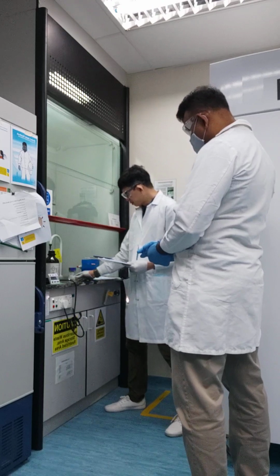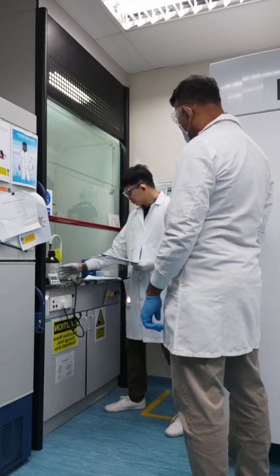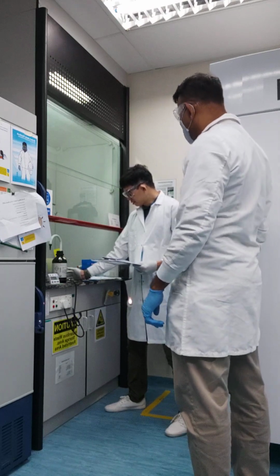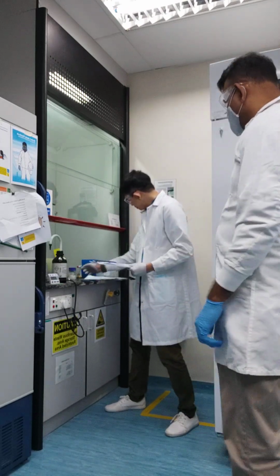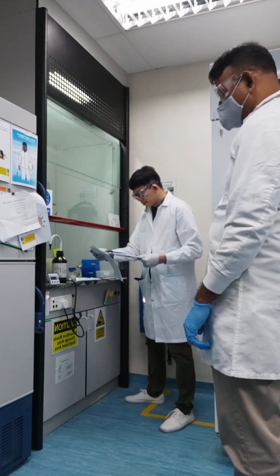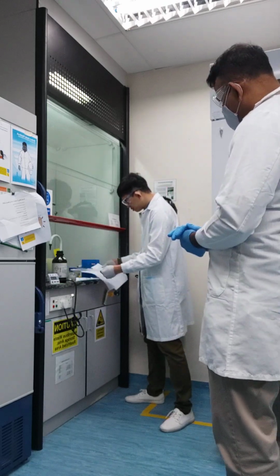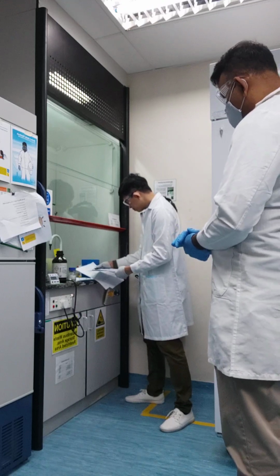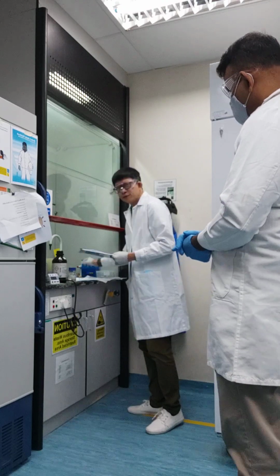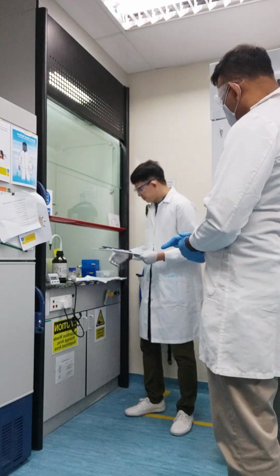So step 1 is we will look at the title. Today I'm going to handle HCl, hydrochloric acid. I'll look at this title, then I follow the batch record here. The batch record is reflecting the same name. Then next thing is I need to know the safety information.